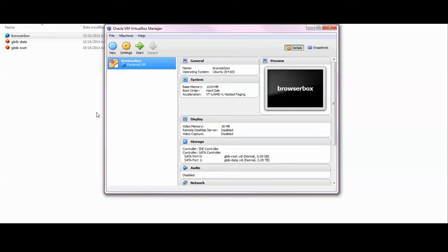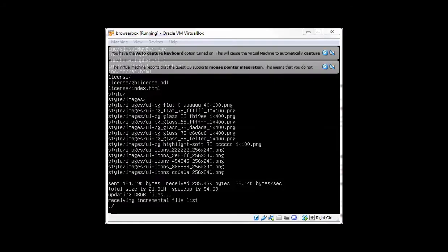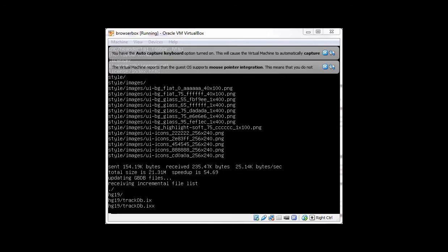Here is my VirtualBox Manager. It has found the BrowserBox — it's currently powered off, but we'll turn that on. Everything suggests it's ready to go. All I have to do is click Start, and now the VirtualBox will load up and I will have access to the Genome Browser. When the BrowserBox starts to run, this will set up some downloading and other things that need to get established. You may run through this loading process depending on whether it's your first time loading or if there's been an update. So this may take a little while — wait while this runs, and when it's complete it will tell you it's ready to access with a browser.